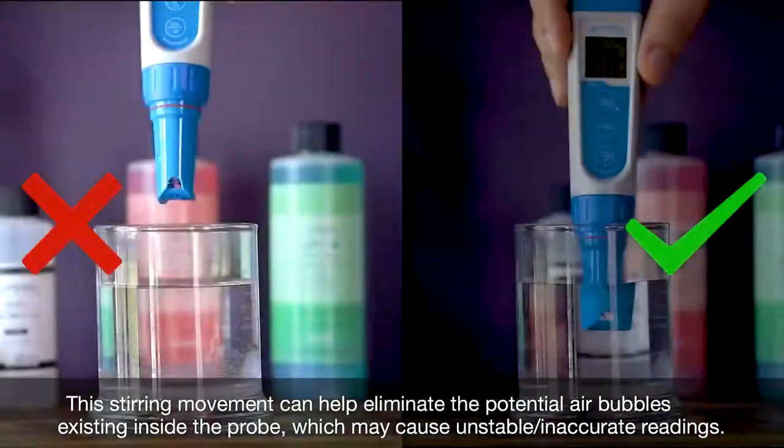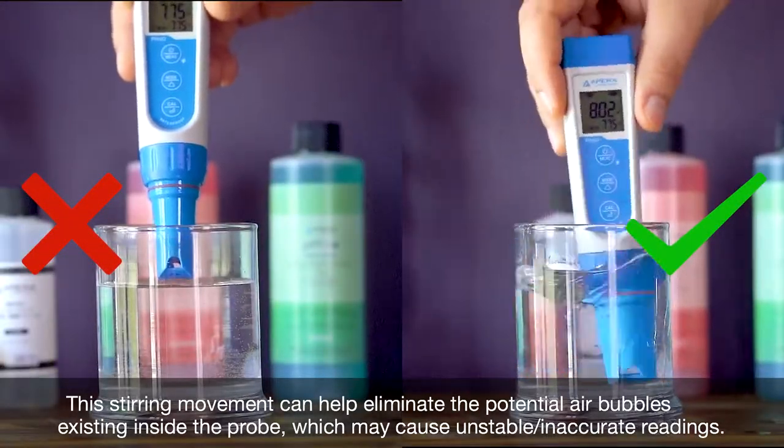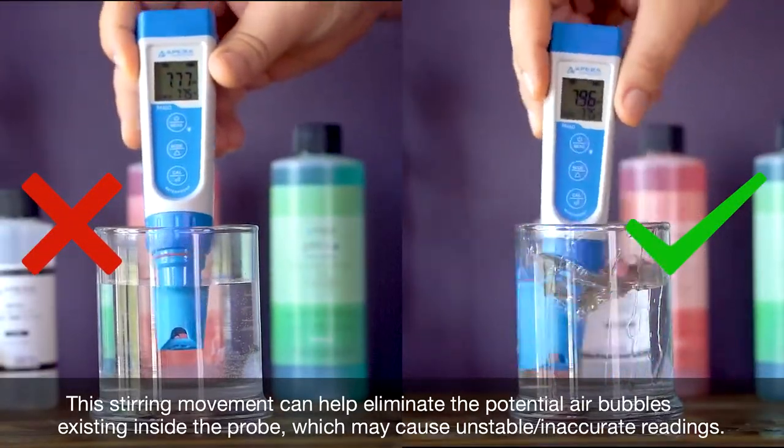The stirring movement can help eliminate the potential air bubbles existing inside the probe, which may cause unstable or inaccurate readings.